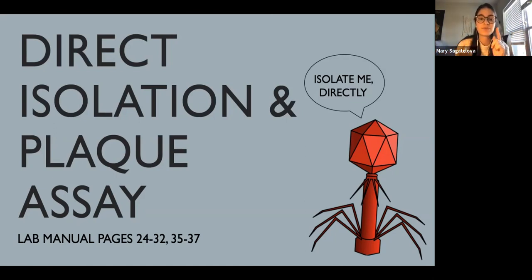I'm going to be walking you through the direct isolation and plaque assay protocol, some of the mentalities behind it, why we do what we do, and also physically how we're going to do it. If you want to follow along, this is going to be in your lab manual, pages 24 to 32 and 35 to 37, if you want to take notes. Okay, so let's get into it.